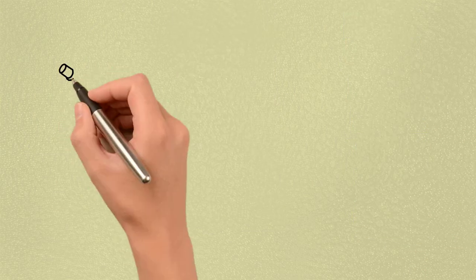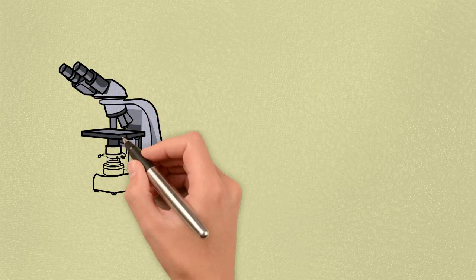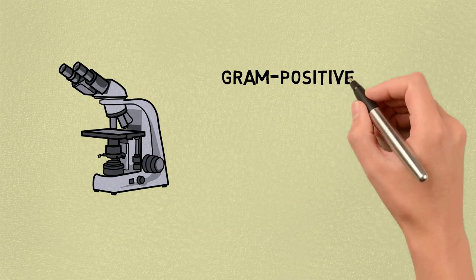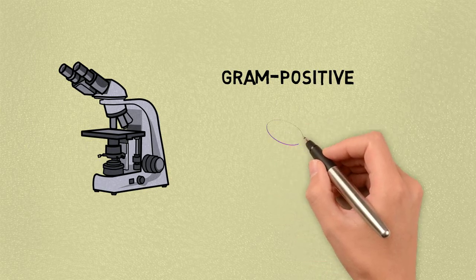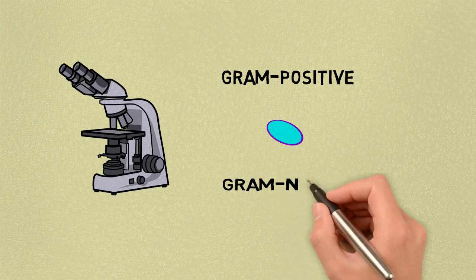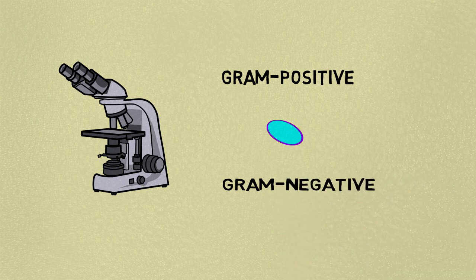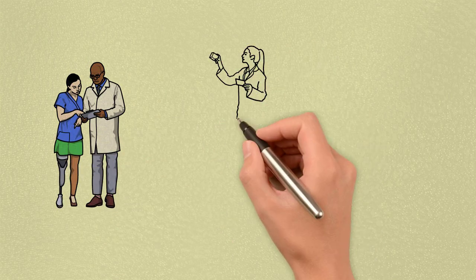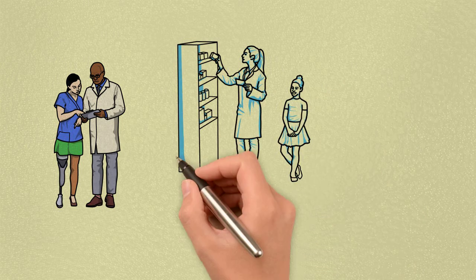Gram staining is a bacteriological laboratory technique used to differentiate bacterial species into two large groups, gram-positive and gram-negative, based on the physical properties of their cell walls. The gram stain is not an infallible tool for diagnosis, identification, or phylogeny, and it is of extremely limited use in environmental microbiology. It is used mainly to make a preliminary morphologic identification or to establish that there are significant numbers of bacteria in a clinical specimen.